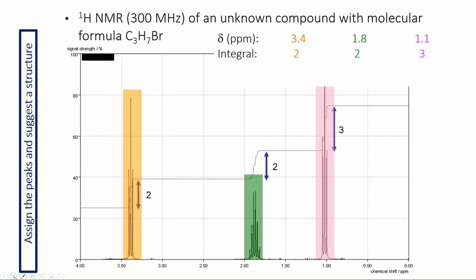Now, I know and you know that the ratio is also a type of empirical system, and so you can see it corresponds to the number of protons in the molecular formula. There's 7 protons, and we have a ratio of 3 to 2 to 2, so each of those numbers corresponds to the number of protons that we have in our sample.